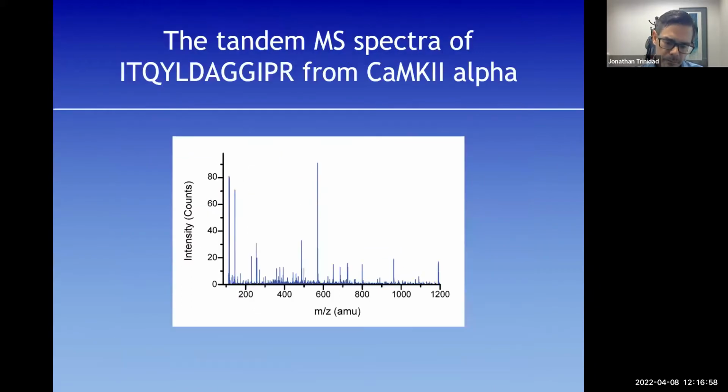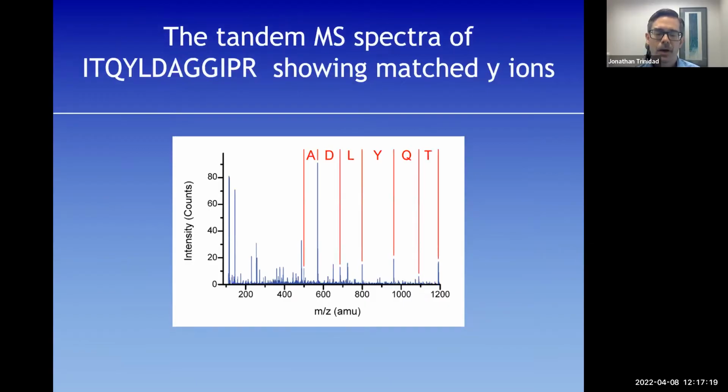And you look at the spectra, and if you sat there with a pencil and paper, and the table of all the amino acid residue masses, you can start to find pairs of masses and walk along to sequence the peptide de novo. Of course, we don't do that. We don't use that exact algorithm either by hand or by computer. What we end up doing is pattern matching against protein databases. So unlike gene sequencing, where you really don't need to know anything to read off the exact residue pattern, modern mass spectrometry or proteomics really relies on pre-existing protein databases.